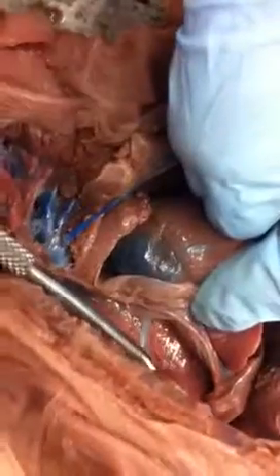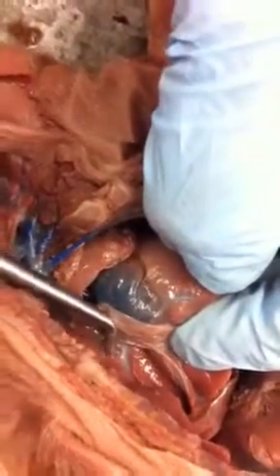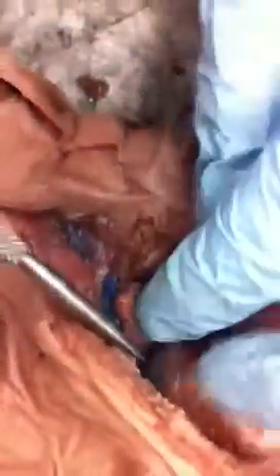See, the blue one's good, but the pink ones you can't really see. Now I can kind of imaginary see them, some right there. And the blue ones are the pulmonary arteries. Yeah. Which normally the arteries are pink. Backwards. Okay. Anterior vena cava, that was up here, right? See through my fingers right there.